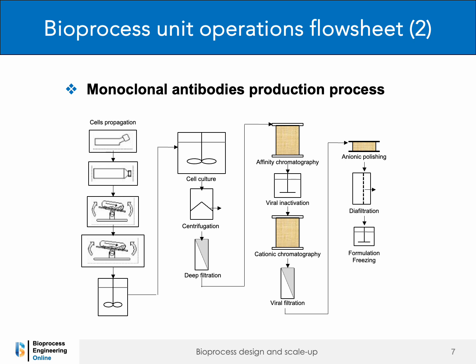In contrast, more complex processes, like the production of highly purified therapeutic molecules, such as monoclonal antibodies, may entail up to 10 or more operations, including multiple final chromatography steps.